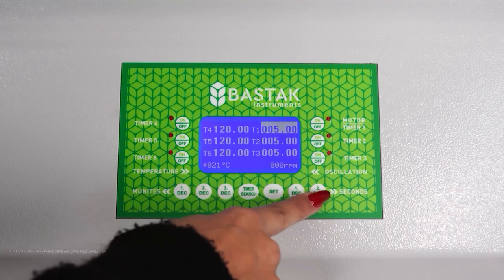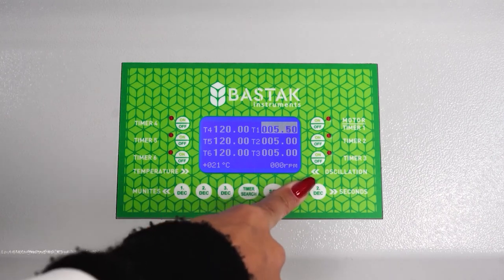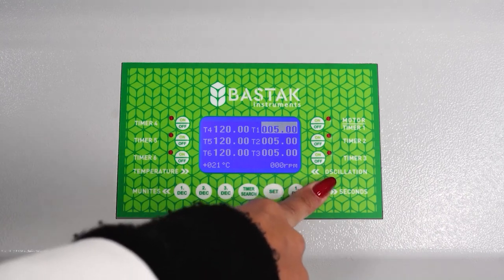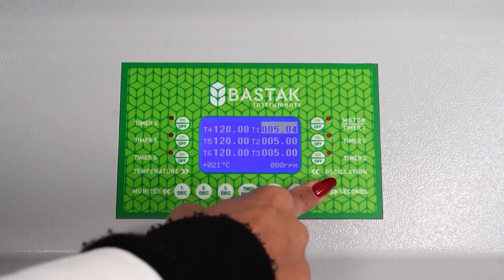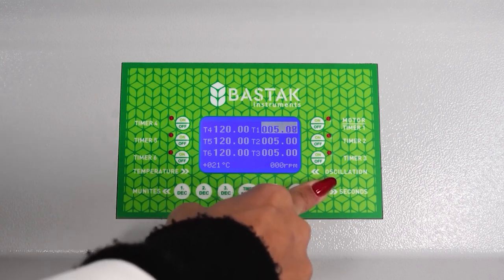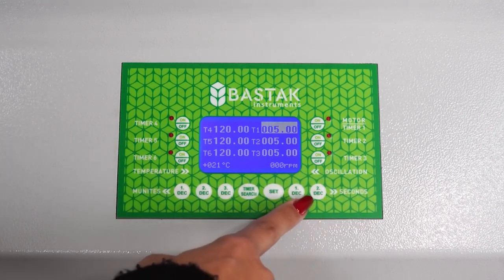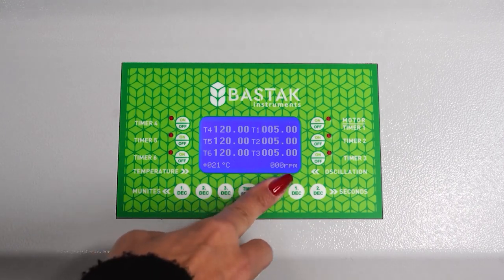To set the first and second digits in the second row of the timer search with painted numbers: the 1 DEC button is pressed until the desired digit between 0 and 5 appears on the screen, completing the adjustment of the first digit of the two-digit seconds. The 2 DEC button is pressed until the desired digit between 0 and 9 appears on the screen, completing the adjustment of the second digit of the two-digit seconds. The Set button saves the value entered with the DEC buttons and exits the operation.